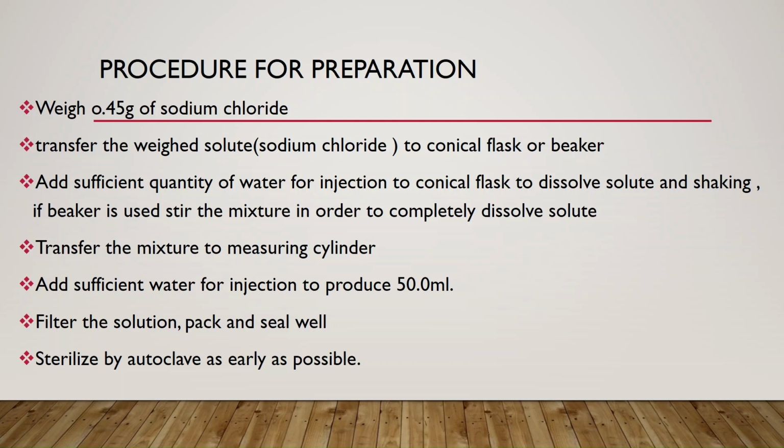So either of them will do the same work of dissolving your sodium chloride. So add sufficient quantity of water for injection to the conical flask to dissolve the solute, shaking, or if a beaker is used, stir the mixture in order to completely dissolve the solute.